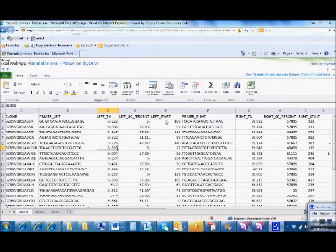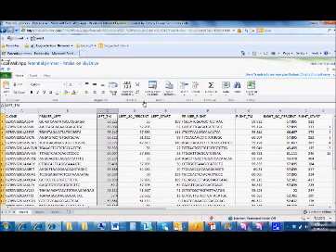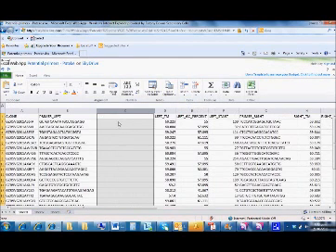I've got the spreadsheet here on the screen, and just for example, one simple way that you might want to do it is to use formulas. I'm not going to show you any specific formulas, because I think that's part of the challenge of figuring out how you can use this software innovatively to solve the problem. But just to give you an idea, I could click insert here and put another column in, just there to the left. Then I could press equals, and find a formula that allows me to count the number of G's in this, or search this for 4 G's or 4 C's or 3 C's or 3 G's or 4 A's or whatever.